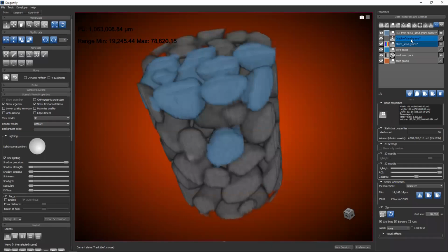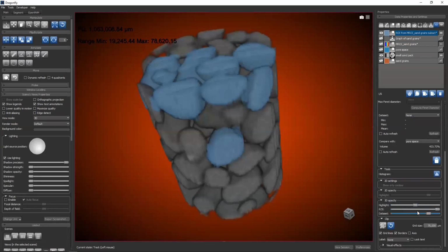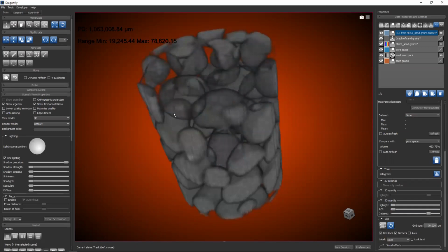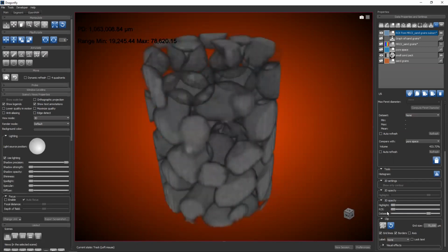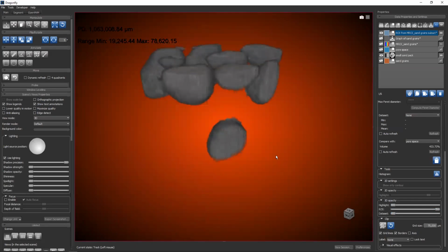Now I want to just show you a feature of an ROI. When you select an ROI, as I described earlier, there is this 3D opacity panel, so I can highlight just those grains that were in that selection. This is a binary ROI. An ROI is just every pixel in the entire data set is either labeled or not labeled. So this loses the individual labeling that you have from a multi-ROI. So this is just an ROI, so I can adjust the highlight, but I can also say I want to hide those grains, so now I can sort of see the inverse. So you can either show those grains and hide everything else, or hide everything else and show those grains.